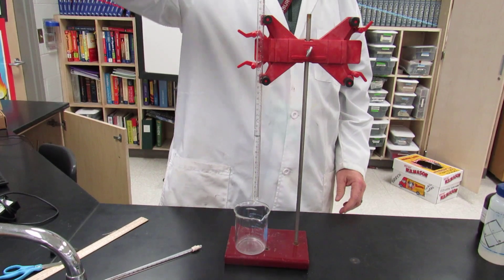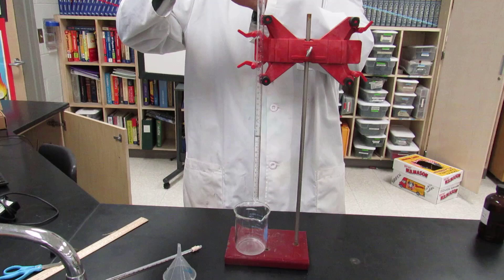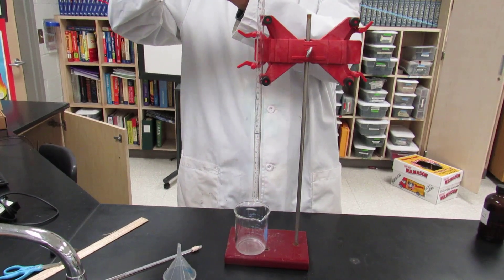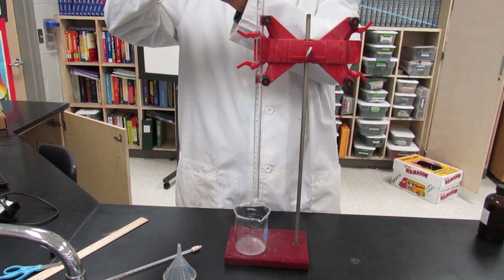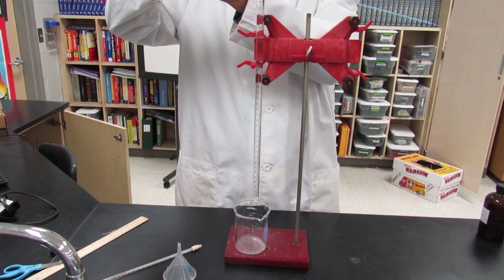Next, you want to put deionized water into the eudiometer. Use your squirt bottle and fill the eudiometer with water. Do this very slowly so that you don't mix the hydrochloric acid.